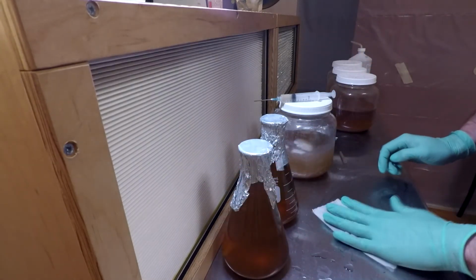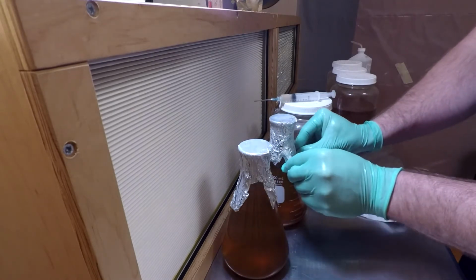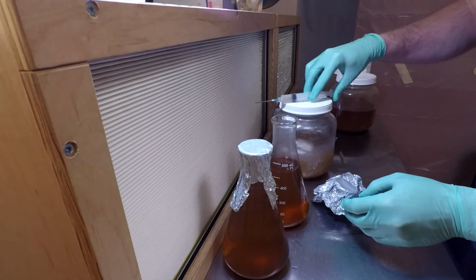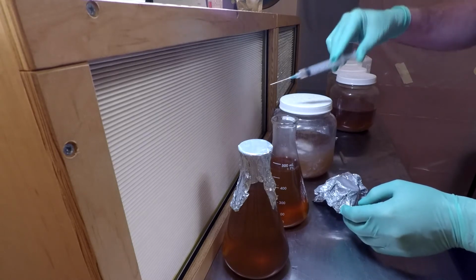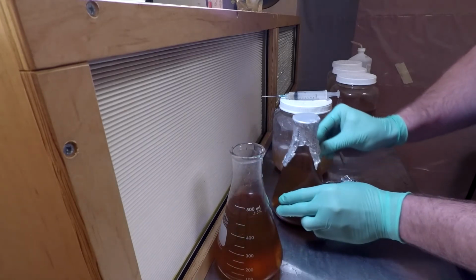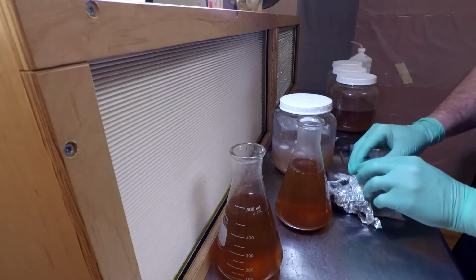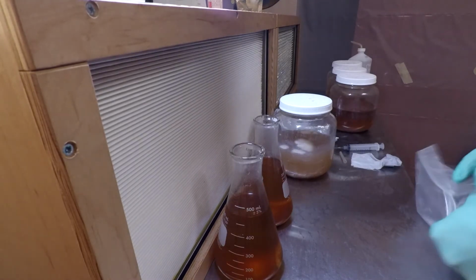Because these flasks have no lid or anything like that, what I'll do is inoculate these, then cover the opening with some parafilm, some lab film. I got enough actually to put two cc's in each one of those as well. Need to order me more of this lab film, almost out.